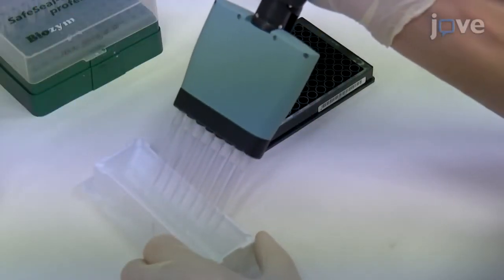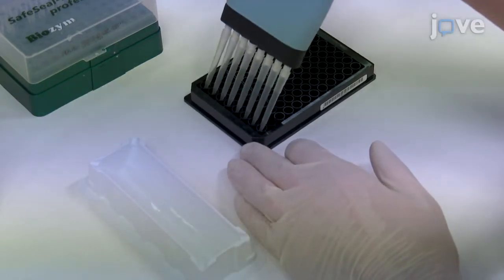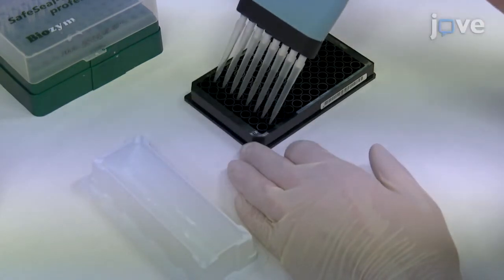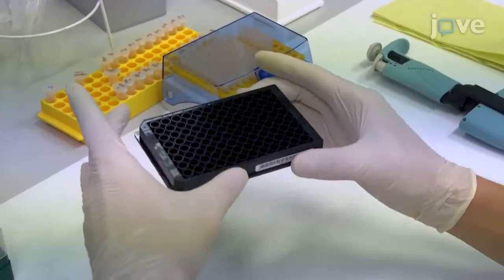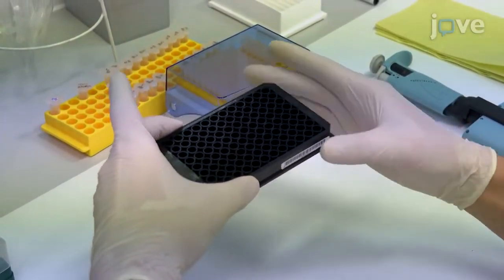To coat the 96-well high-bind plate, carefully dispense 25 microliters of coating solution into the bottom corner of each well using a multi-channel pipetter. Dab the 96-well plate gently on each side to ensure that the coating solution covers the bottom of each well.